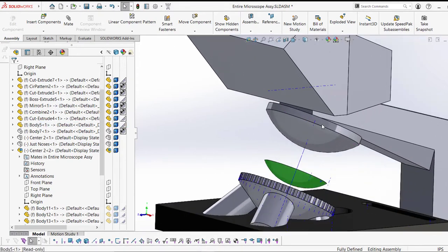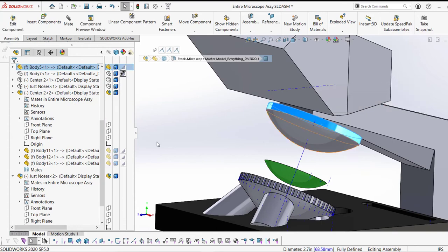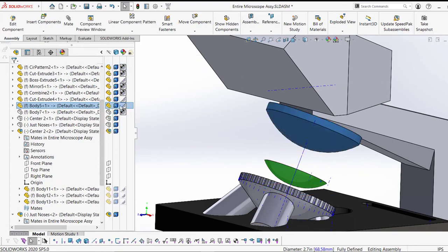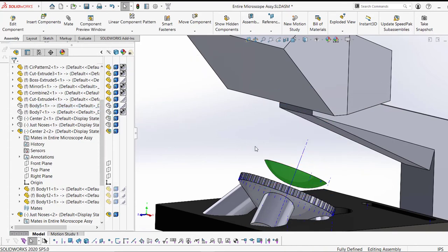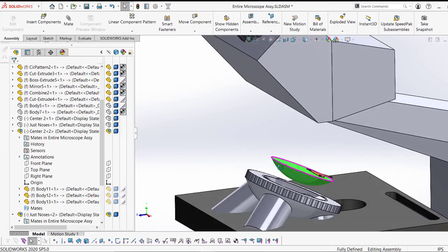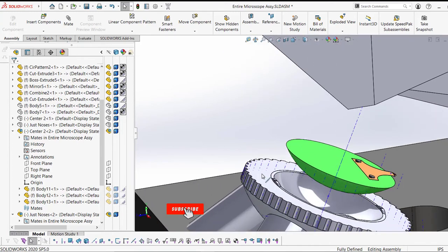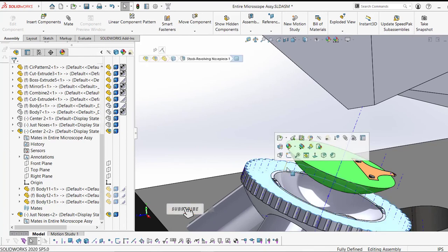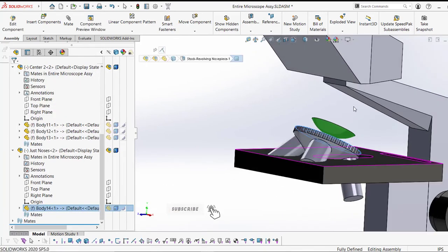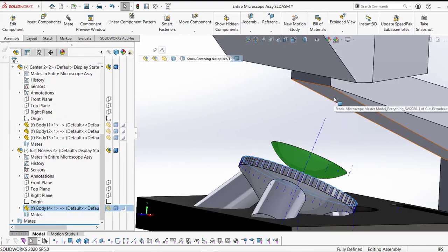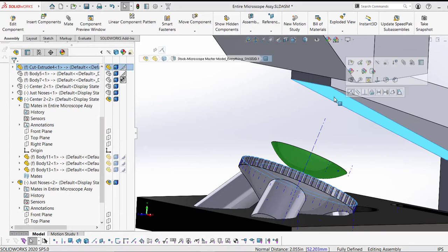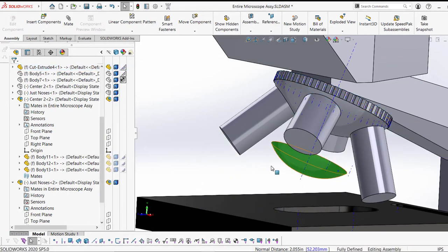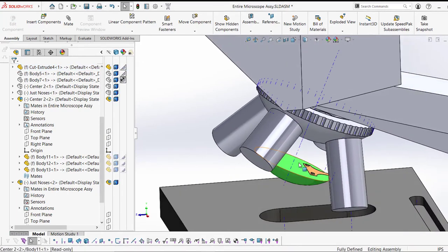We're also going to do it with the nose piece. Now we're going to simply hide the dome. Goodbye. Although the dome is hidden, the mates remain. That's the cool part, the hack, if you will. Now I can peacefully mate and I know that this is going to be in place because of where the dome was. If I didn't have that dome, I would really struggle trying to put this nose piece into the correct position.